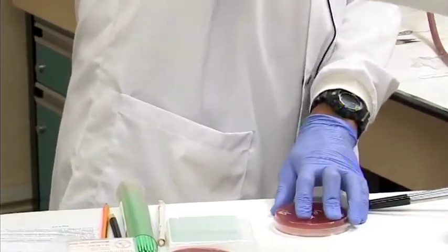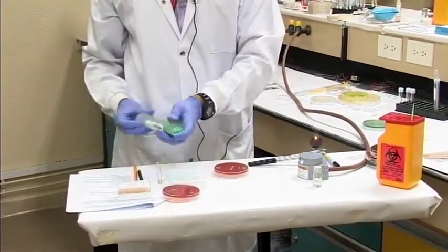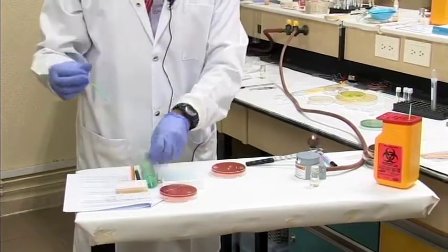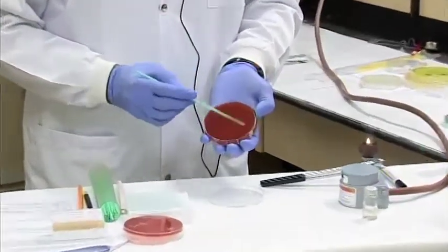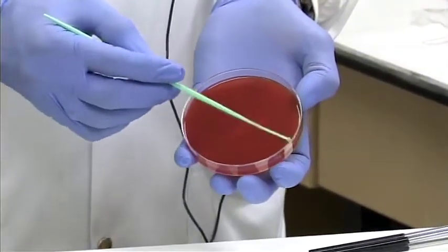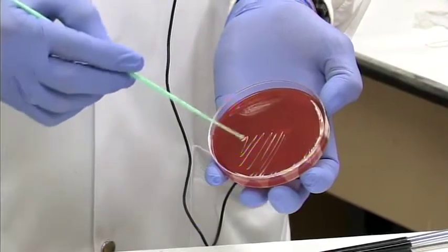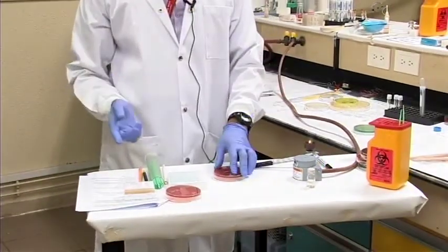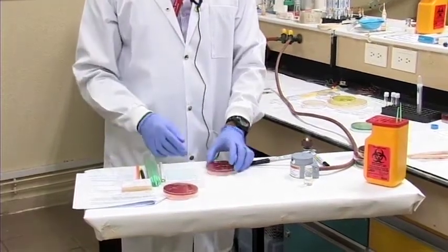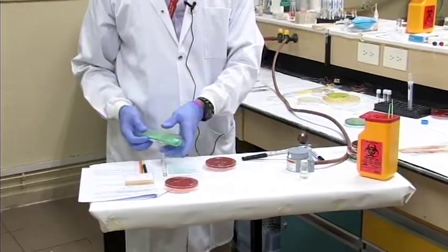Put it in your biohazard container for disposal. You're going to use another loop. Again, you pull out that second quadrant, turn the loop over, pull out the third quadrant, and spread it out over your agar plate. Dispose of your loop. So notice how fast that was. No flaming and cooling. It's very fast by streaking using a disposable loop.